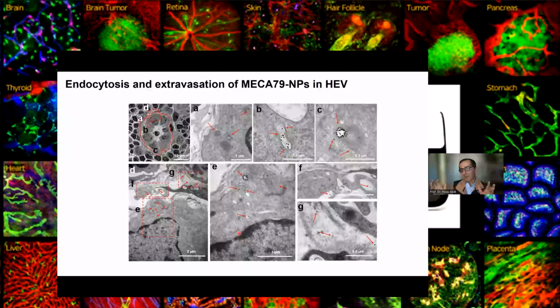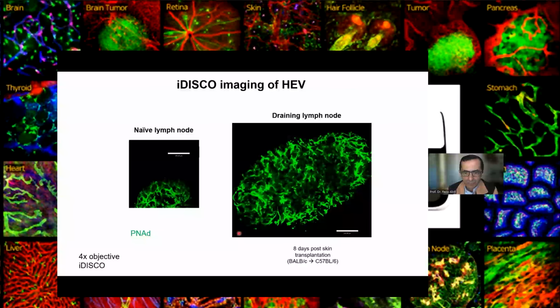Even if you cannot obviously look at the subcellular level, they do pass through tight junctions. In the liver, for instance, the sinusoidal cells are pretty much open. So it would be very cool to show whether these particles can pass through those fenestrations or not. This is one of the big questions we have, which I'm going to pursue more with your imaging technique, to focus on endothelial cells and see how these particles traffic between or amongst the endothelial cells. That's the big question that I'm very much interested in using your imaging technique to answer.